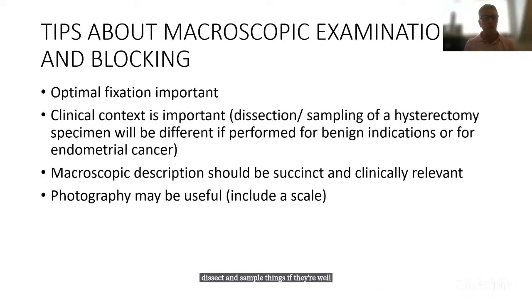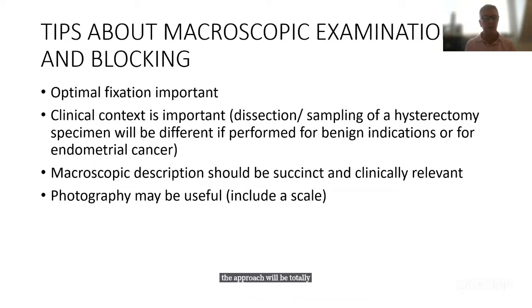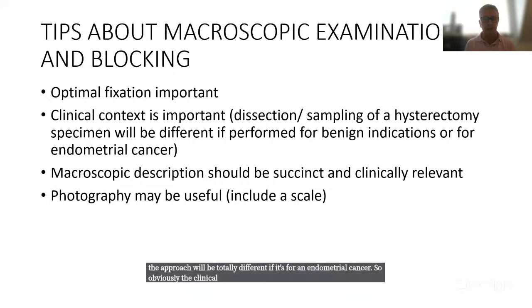And also, of course, the clinical context is extremely important. For example, if you're dealing with a hysterectomy specimen, you're going to have a totally different approach. If it's for something benign, such as uterine prolapse, the approach will be totally different if it's for an endometrial cancer. So obviously, the clinical context is very important.